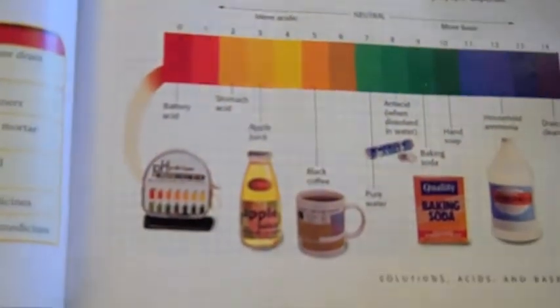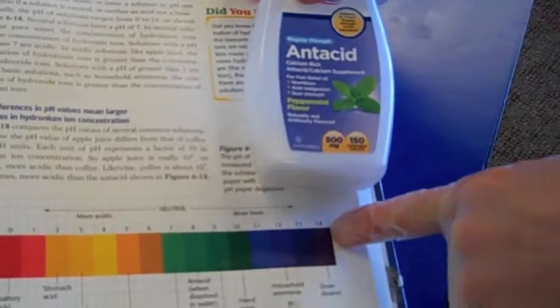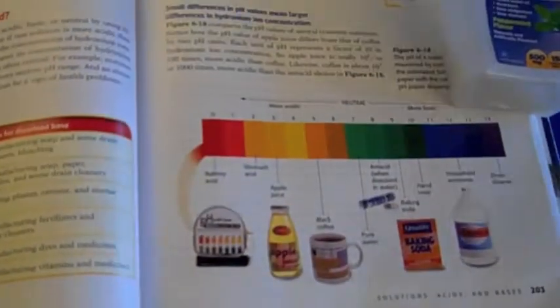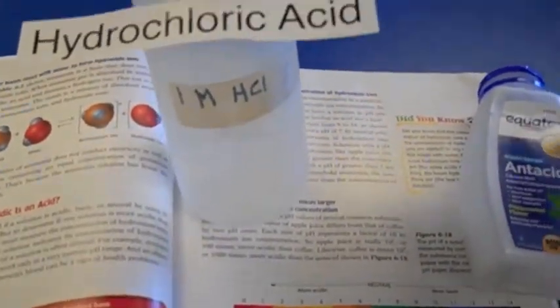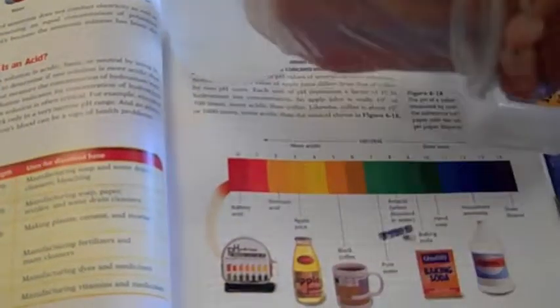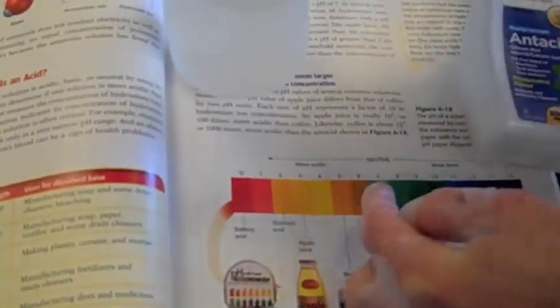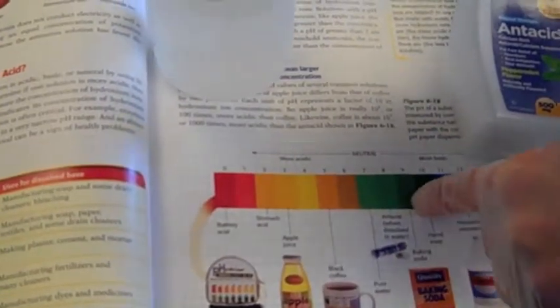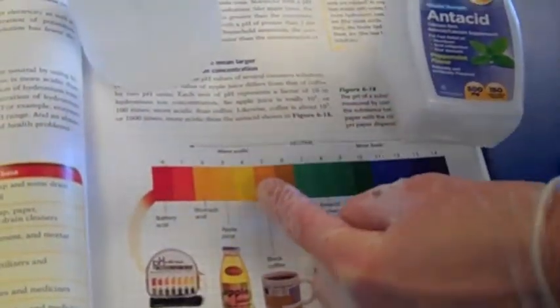Tums is on the base end of the spectrum, and hydrochloric acid is on the acid end of the spectrum. And our indicator tells us when we've added enough hydrochloric acid to cross over the midline, neutral, into acid territory.